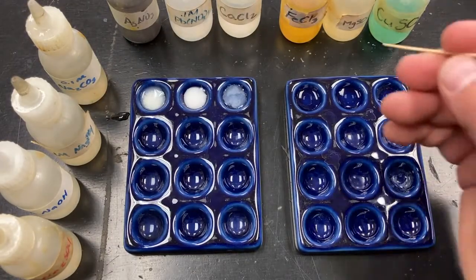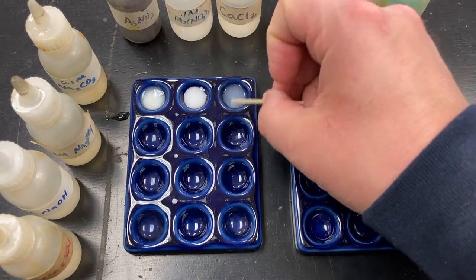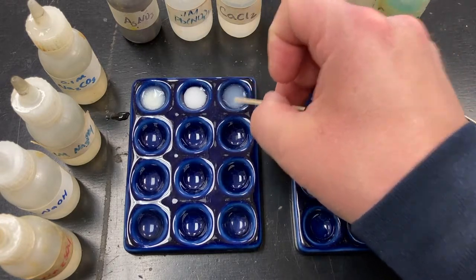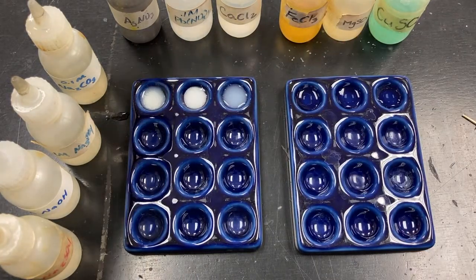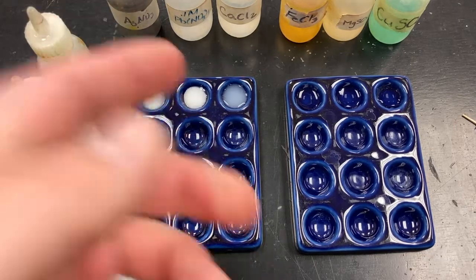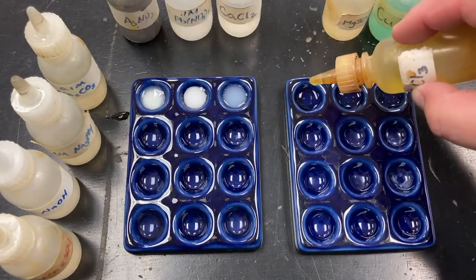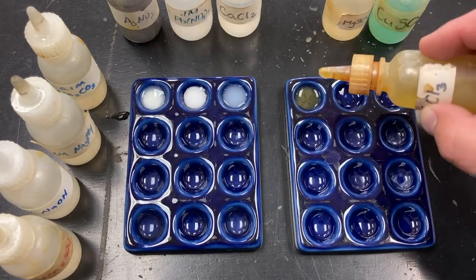Okay, very slight, but there is a kind of a hazy, tiny little white specks. So it looks like carbonate must like to make white precipitates. Let's see if that continues. Well, you're going to use iron chloride. Oh, we see something different now.